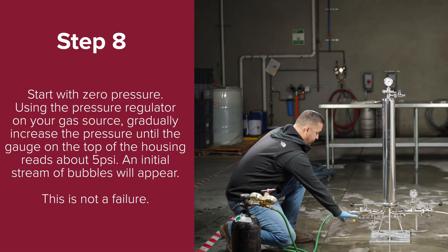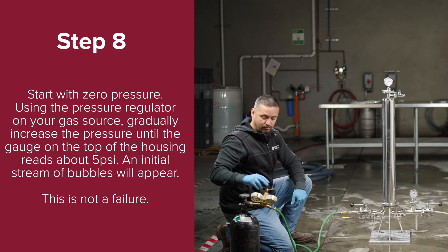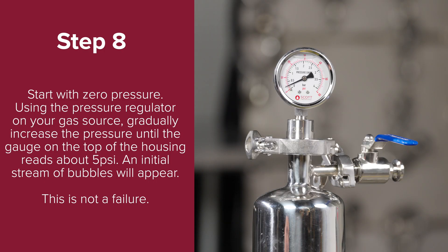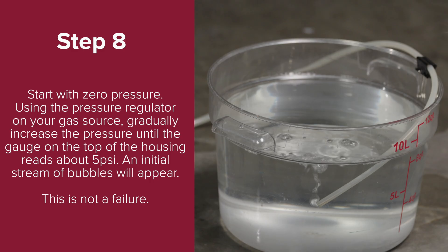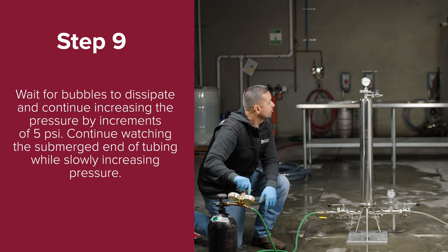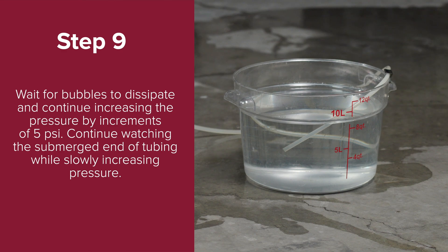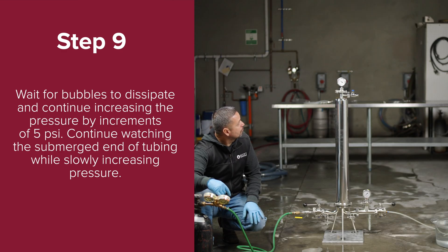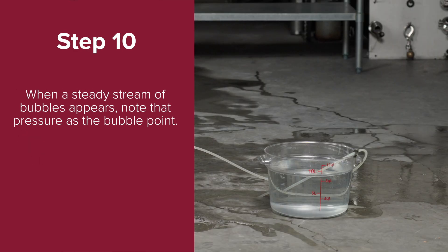Step eight: start with zero pressure. Using the pressure regulator on your gas source, gradually increase the pressure until the gauge on the top of the housing reads about 5 psi. An initial stream of bubbles will appear, but this is not a failure. Step nine: wait for the bubbles to dissipate and continue increasing the pressure by increments of about 5 psi, continuing to watch the submerged end of the tubing. Step ten: when a steady stream of bubbles appears, note that pressure as the bubble point.